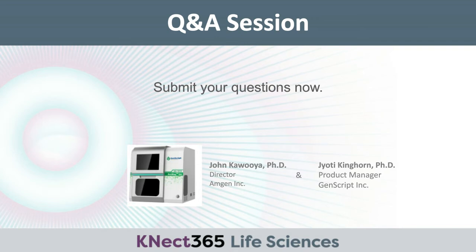That's perfect. Okay. Another question we have, is it correct to say MagBeads are more suited for screening stage of protein purification?